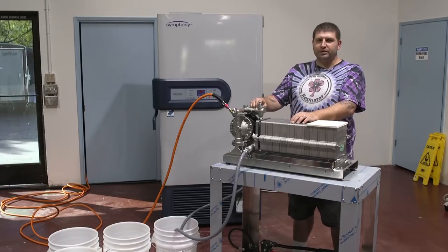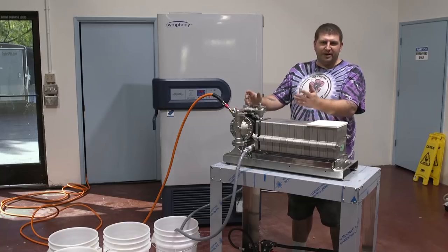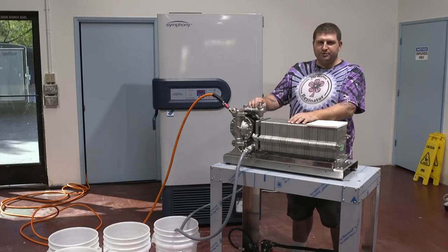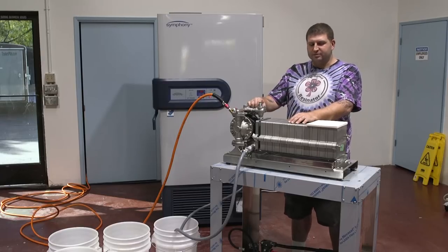The first series video that we released was just general operational principles — how to use it, and it might be a little bit messy. This one's going to be more refined because we have winterized material. The material that we're using was previously brought down with a low micron paper and scrubbed at room temperature.